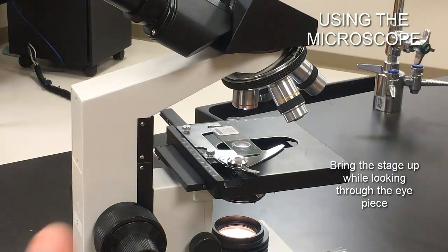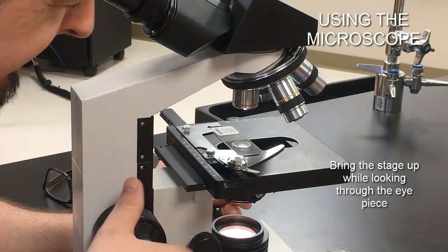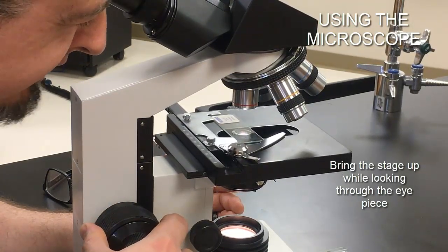So center everything, put the stage all the way down, start with the 4x scanning objective — that's always where you begin. Then put your eyes through the ocular. Rotate the coarse knob, bringing the stage up until your image comes into focus. You're finding the focal point — the point between the objective and the slide where the image is resolved and can be seen clearly.